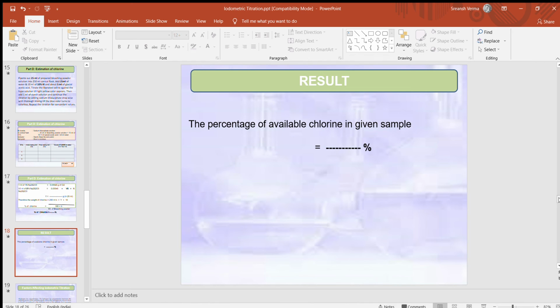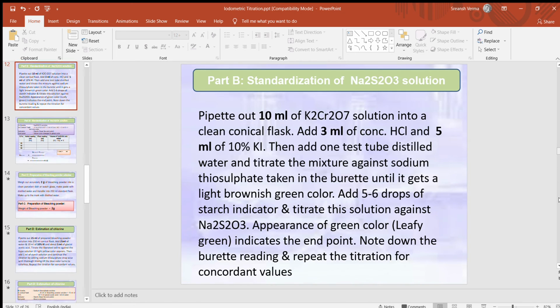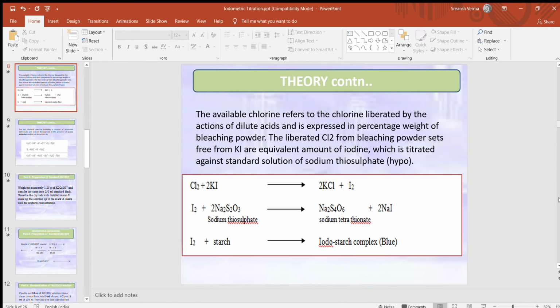So now what we are doing, basically, is reducing the concentration of that iodine through the titration and making the solution light in color. Light in color means that the concentration of iodine is reduced over there. So when at the reduced concentration you add that starch, at that moment the phenomenon of absorption will be there, and iodine is going to sit at the surface of the starch.